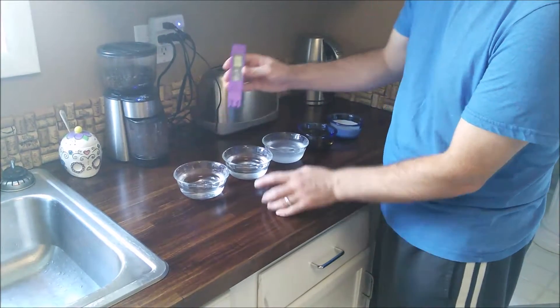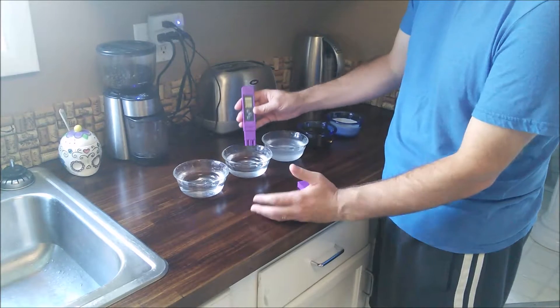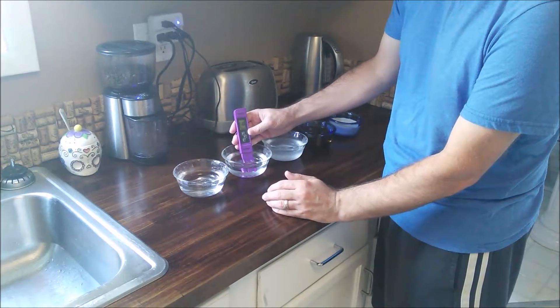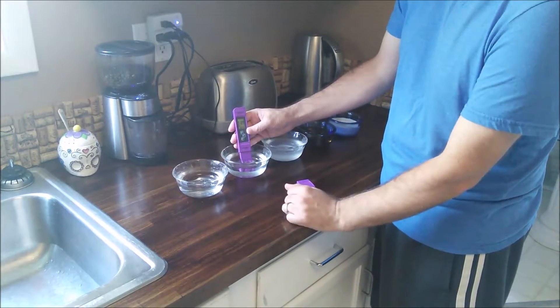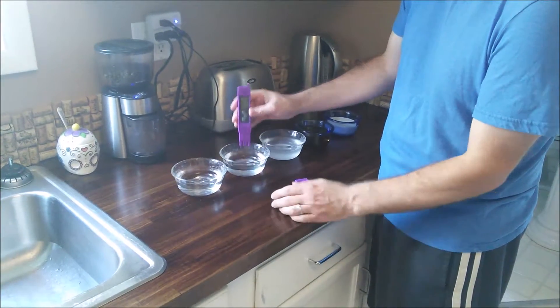Then I have some filtered water from our carbon filter, which should be lower in terms of parts per million. It's actually a little higher — because we have a mineral filter on our refrigerator, the added minerals bring it to a slightly higher parts per million. Interesting.